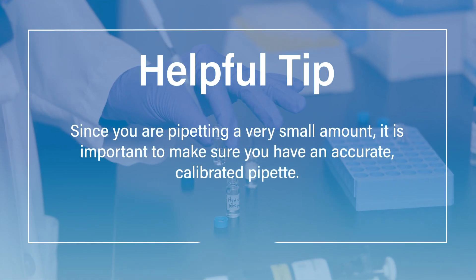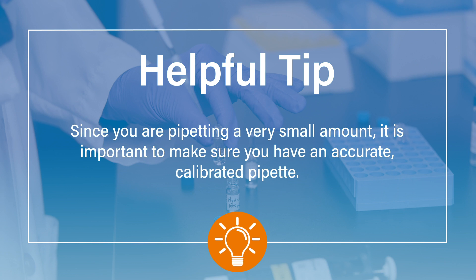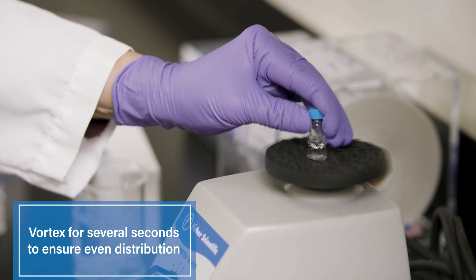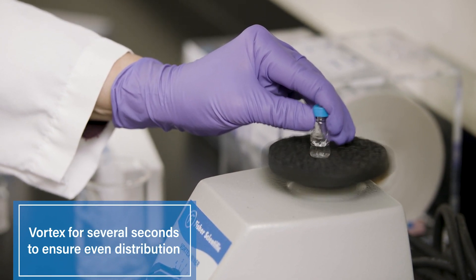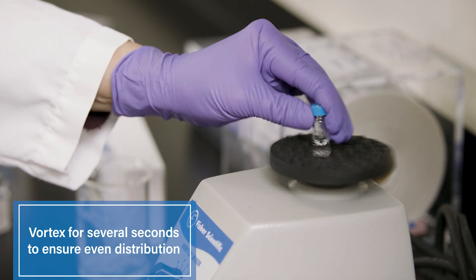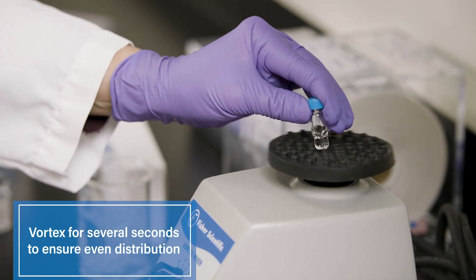Here's another tip: since you are pipetting a very small amount, it is important to make sure you have an accurate, calibrated pipette. Now vortex the sample and borate buffer for several seconds. This is critical to ensure the amino acids are evenly distributed within the borate buffer prior to derivatization.